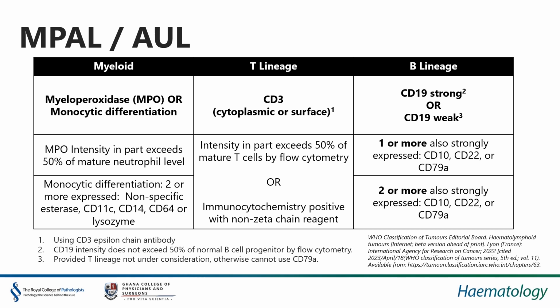Now, when we're performing flow cytometry, it's very important that we use bright fluorochromes such as phycoerythrin, APC, or some of these newer brilliant or bright brilliant violet dyes that actually provide an increased dynamic range that aids in the determination of these cells.